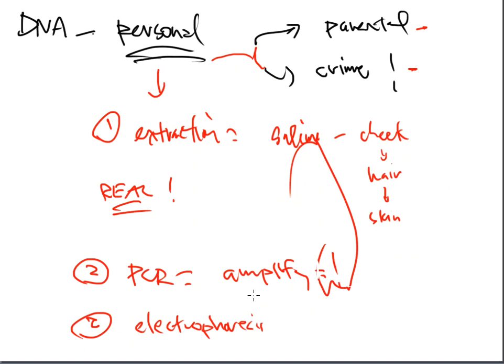The electrophoresis is still going to include an agarose gel. It's still going to include a buffer. You're still going to inject your samples into the gel and allow them to band out, and then analyze the banding that you begin to see from your staining and destaining process. So this piece in particular is nothing new. We've already seen it. We've already done it twice.